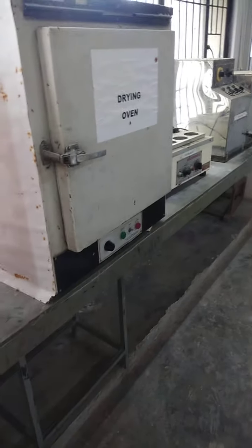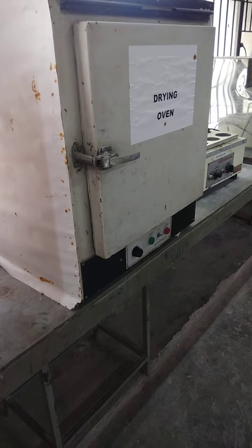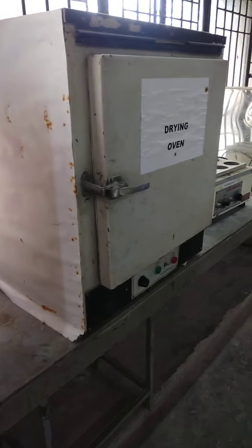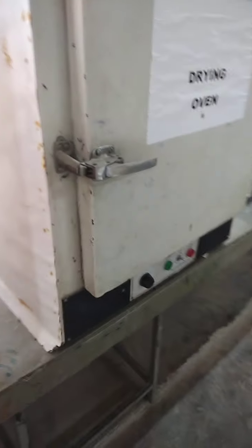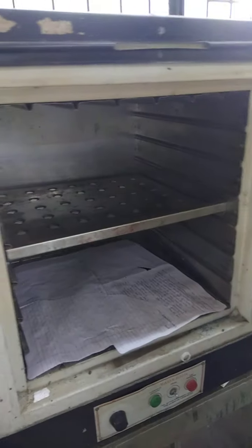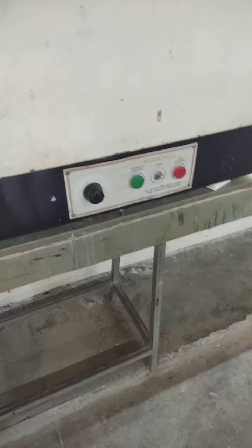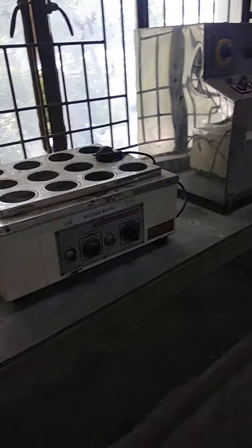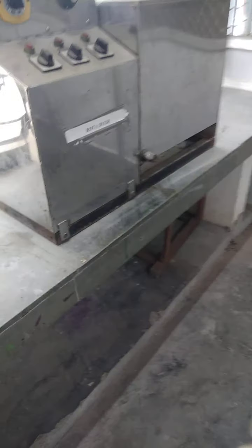There is a drying oven in the lab. In the drying oven we dry the samples — printed samples or dyed samples. We can set the temperature using the controls on the monitor.